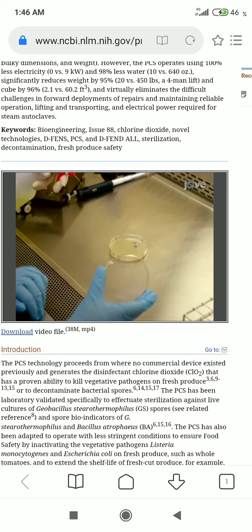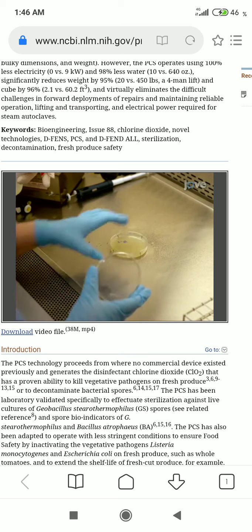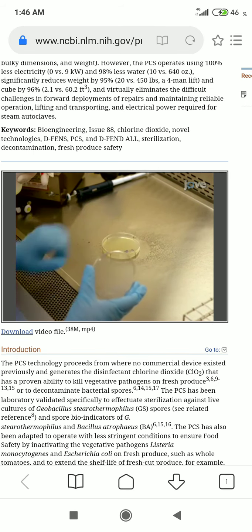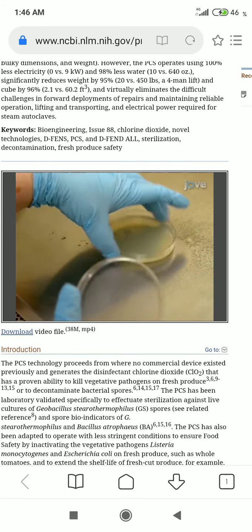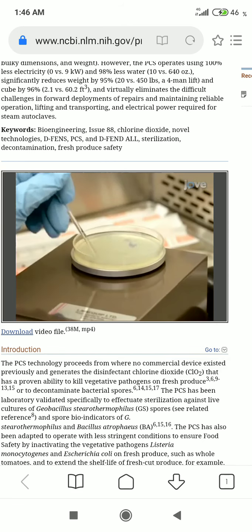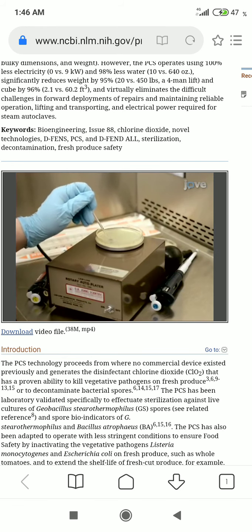Spray Defend disinfectant solution onto the agar surface using consistent, steady force to dispense approximately equal volumes of solution per spray trigger pulse, and rotate plates 90 degrees between successive pulses to uniformly cover the agar surface. Also use a glass hockey stick, applying light pressure to spread solution over the agar surface, equivalent to mechanical abrasion from wiping or scrubbing.